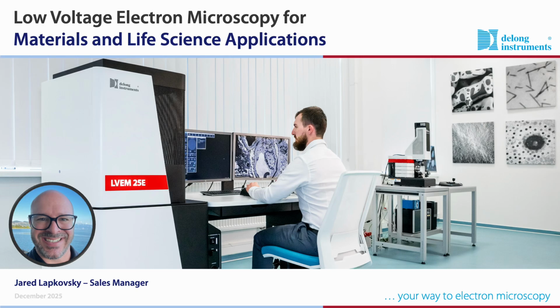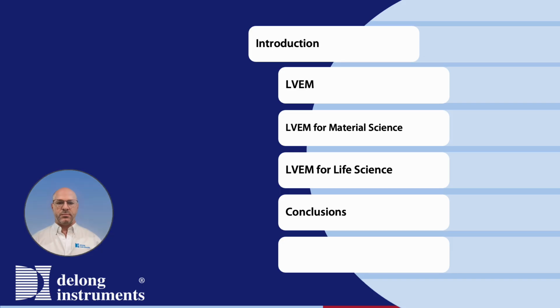The topic of this presentation will be low voltage electron microscopy for materials and life science applications. I will start with a brief introduction of the relevant electron microscopy topics, such as transmission and scanning modalities, followed by an introduction to low voltage electron microscopy. After that, we will dive into more detail about the uses and advantages of LVEM for both material and life science applications.